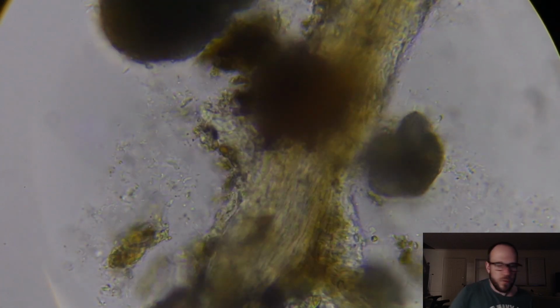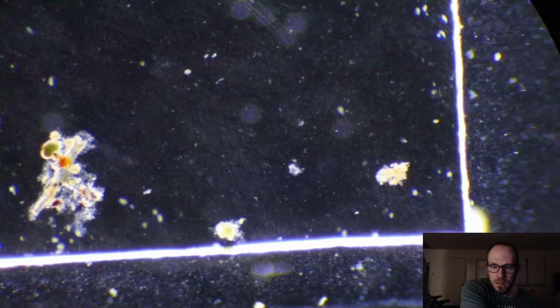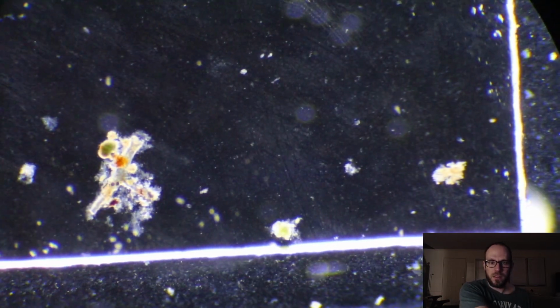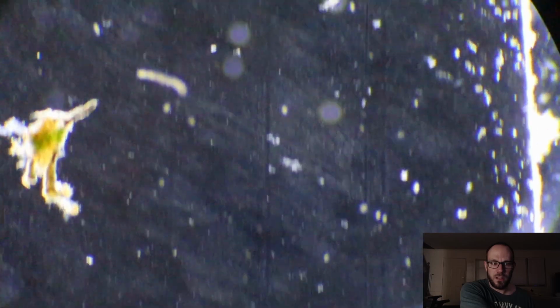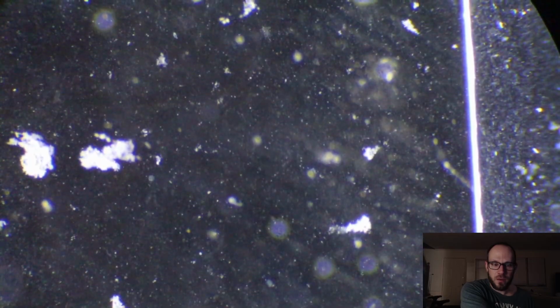You know what? Whatever we're looking at, it ain't much. Filter back in place. Light all the way up. Alright. So, I don't know what's up with that. I think my hypothesis that there was a calamitous event involving a ton of bacteria might be what happened here.